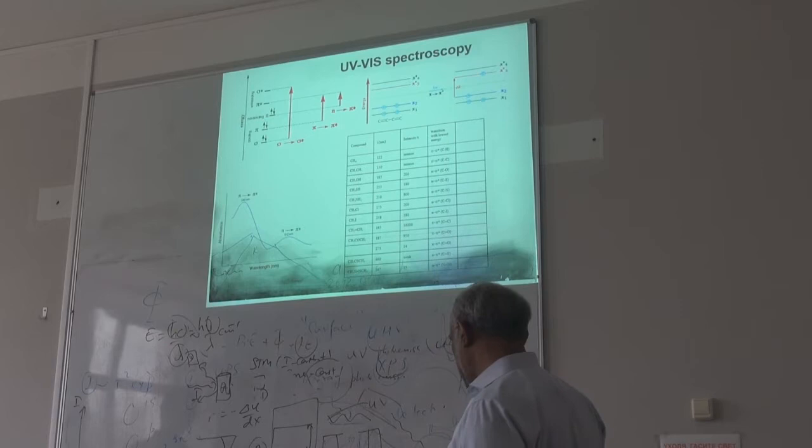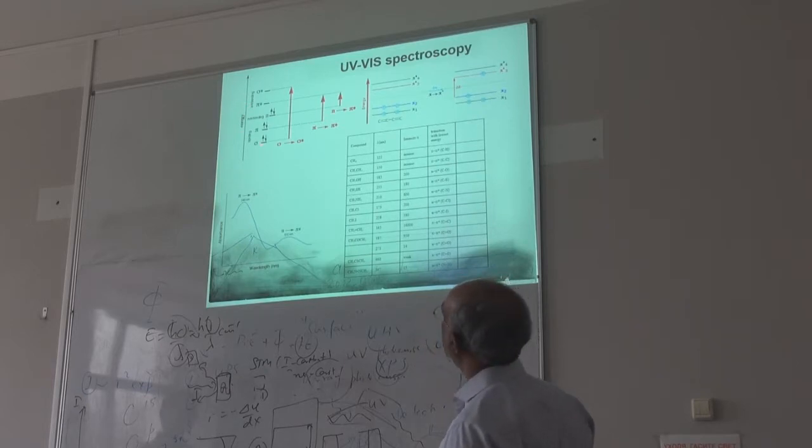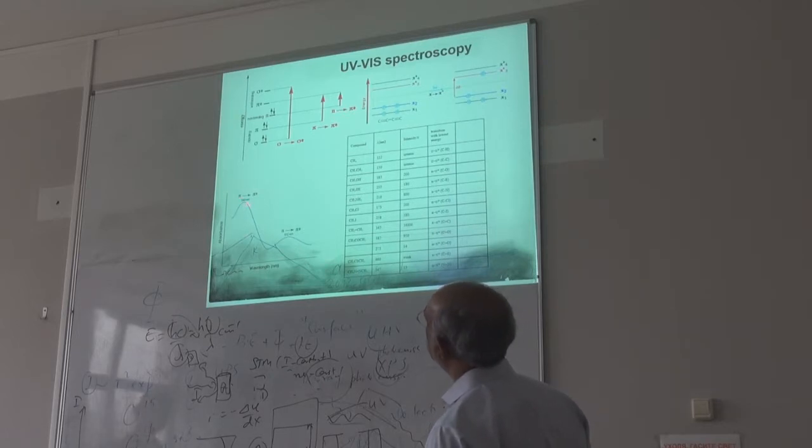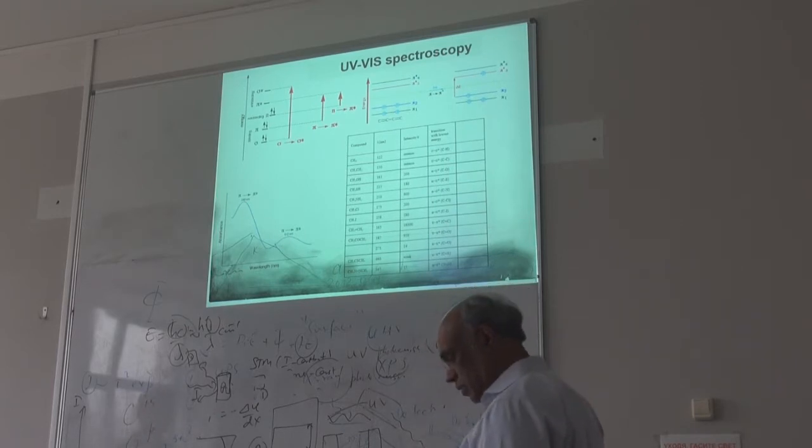So here, if you look at simple molecules, your absorption can be due to transitions between typical molecular bonding and anti-bonding states. We call this the sigma bond, a typical organic molecule. If you have any transition like this, you can see those features in the absorption, this coming from this transition and this coming from that transition. Any absorption you can look at very easily with UV-visible.